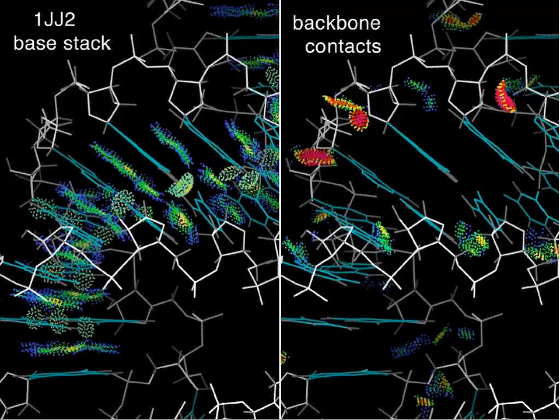Now, this is an unusually bad area, but even at the original Haloarcula marismortui ribosome structure at 2.4 angstroms, about 1 residue in 10 has something impossible on the backbone. And you don't see these until you add all the hydrogens explicitly, which is what MolProbity is particularly good at, and that's one reason that we got into this in the first place.